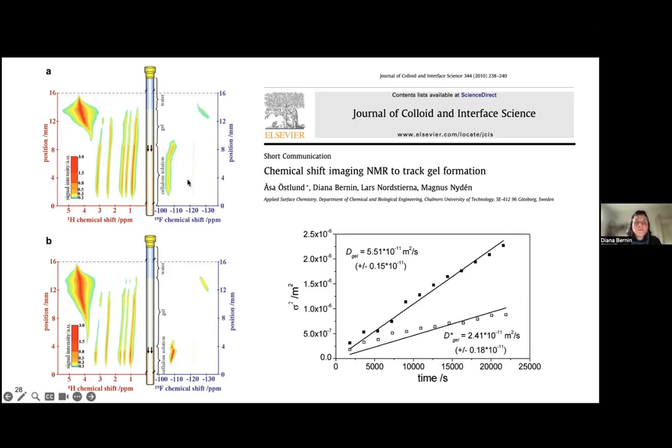So then you would measure proton and then fluoride and proton and fluoride without needing to change the sample. And the fluoride ions are very sensitive. So you can see that water has a completely different chemical shift compared to when it is in this solvent. And then you can see the water is very broad because it's interacting a lot, moving further and further and further.